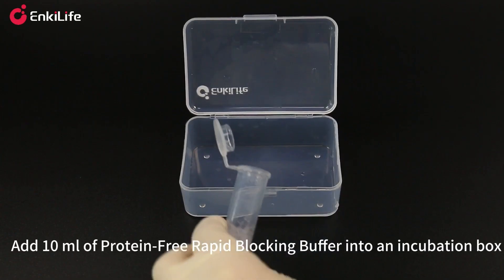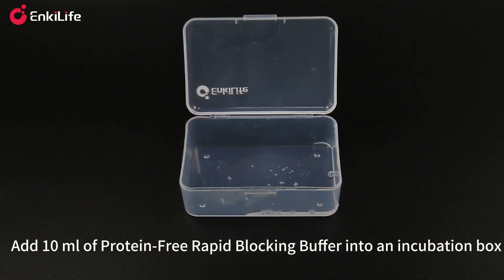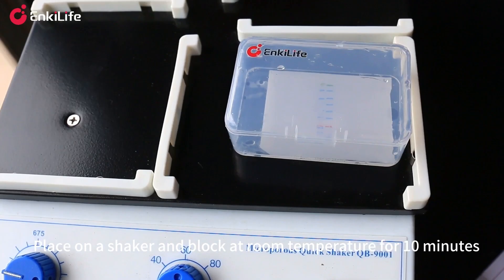Add 10 milliliters of protein-free rapid blocking buffer into an incubation box. Quickly place the transferred membrane into the box, place on a shaker, and block at room temperature for 10 minutes.